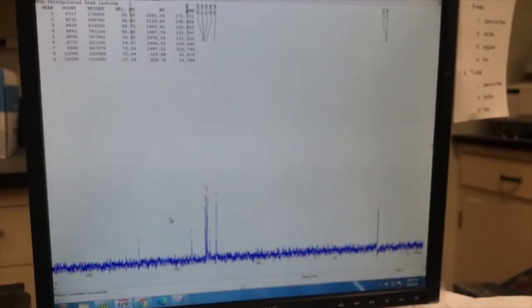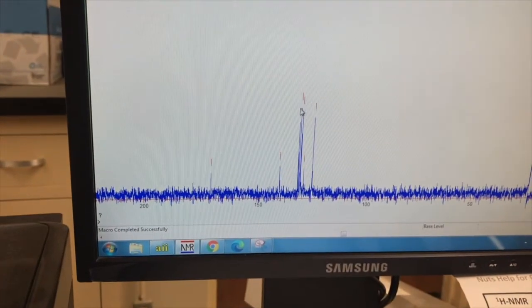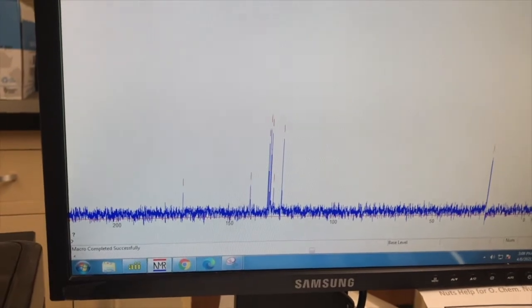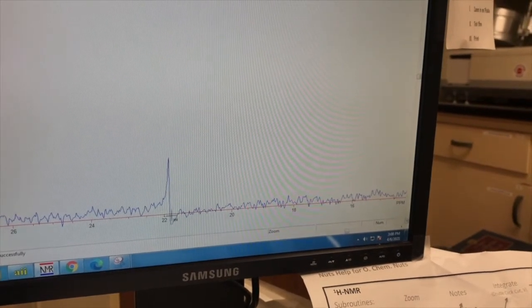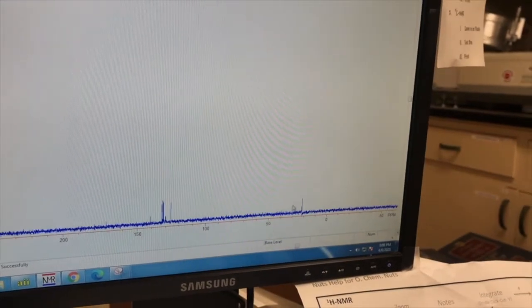Yep. Oh, we got 9 now. What's the 9th one? 1, 2, 3, 4, 5, 6, 7, 8. Oh, they're counting this as 2. Let me look at that again. Oh, it's getting confused. It's counting this reverse peak for some reason. We spent all this time to make this nice.